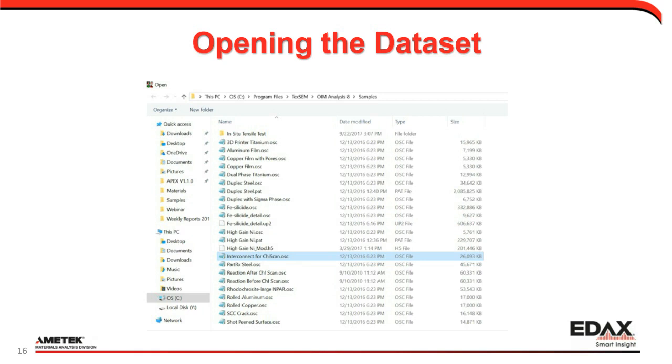I highly, highly suggest you go through all these tutorials, especially if you have a new user in your facility. Say, hey, you've got a Friday, you don't want to do any real work, right? Go ahead and sit down, do these tutorials, learn, and add to your knowledge base in general. So you just go to File, Open, and then click on the data set. In this case, we're using what's called Interconnect for Chl-Scan.